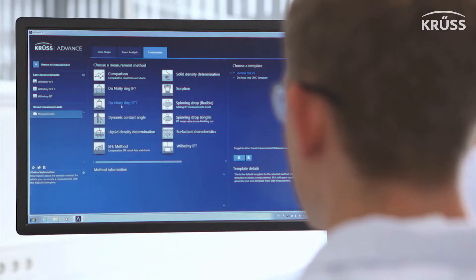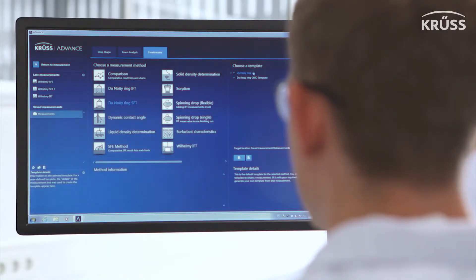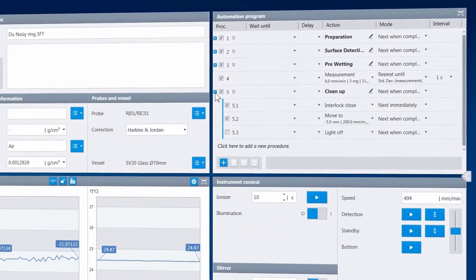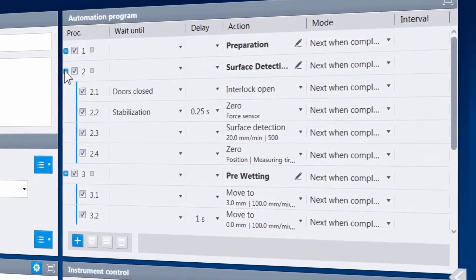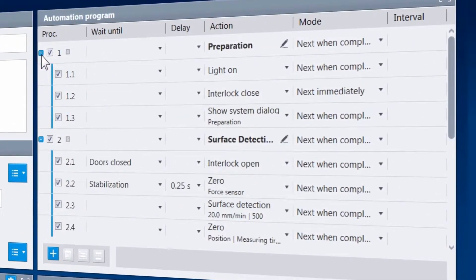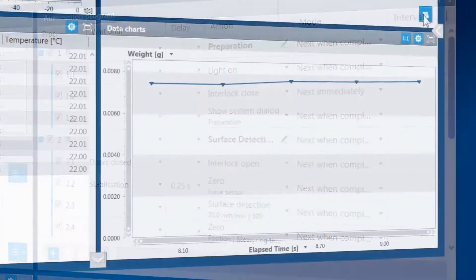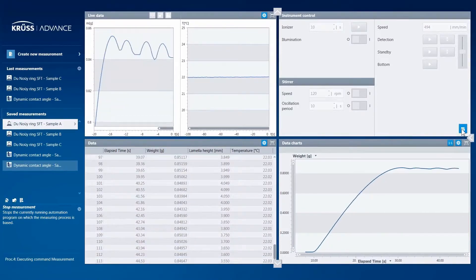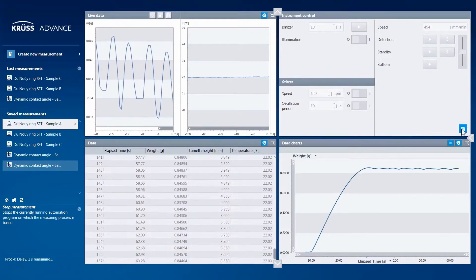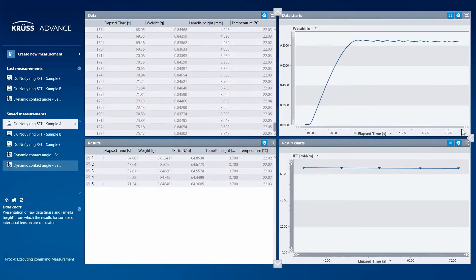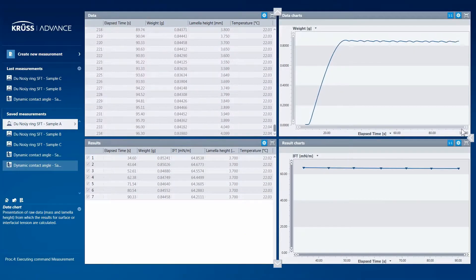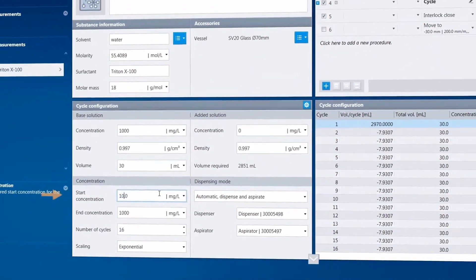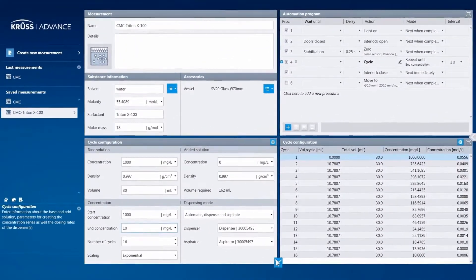All of the possibilities which the K100 offers are controlled through one intuitive piece of software: Advance. Every measurement method has pre-made but easily adjustable automation program templates, so that you can jump right into the science. Additionally, even when making surface or interfacial tension measurements, live measurement data values are actively displayed as clear and comprehensive graphs and charts. Using this software, it is possible to make CMC measurements manually or fully automatically, both forward and reverse, which helps you reduce cleanup times after the measurement.